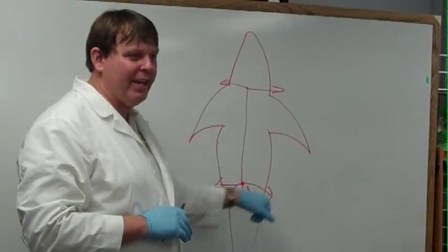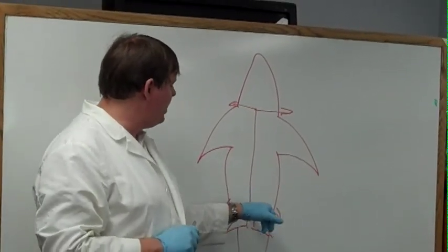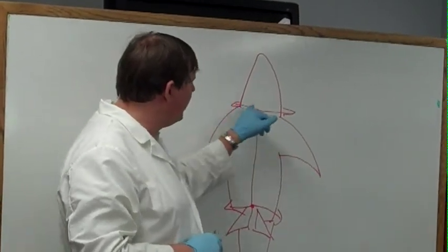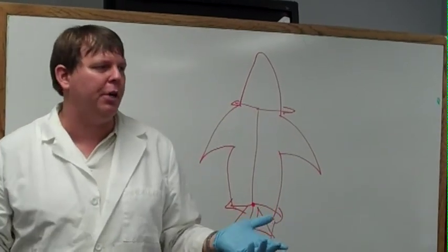This is where all the fun stuff is. In order to get into that, you're going to make an incision down here, cut up to just above where the pectoral fins are, cut across this way, cut across this way, and it will open up like a book.